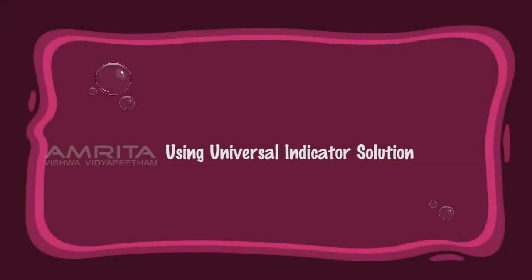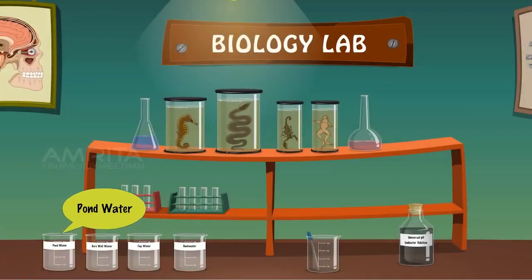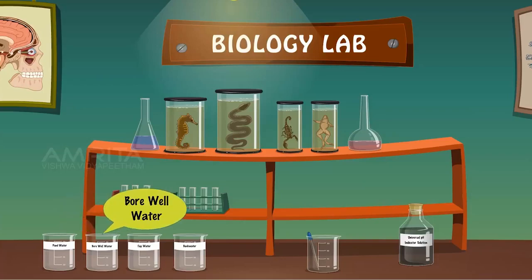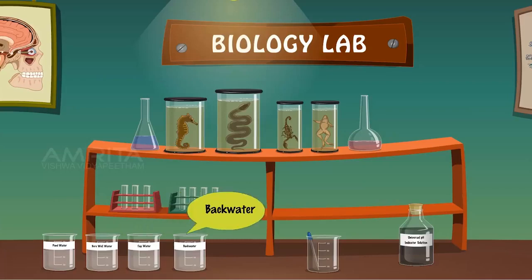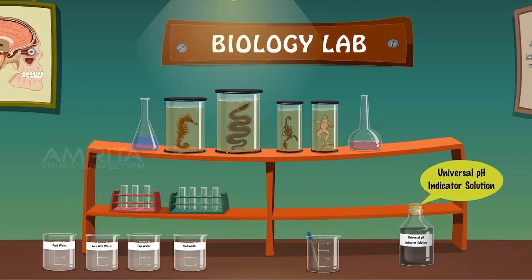Using the universal indicator solution. Materials required: water samples from a pond, bore well, tap water and backwater, dropper and universal pH indicator solution.